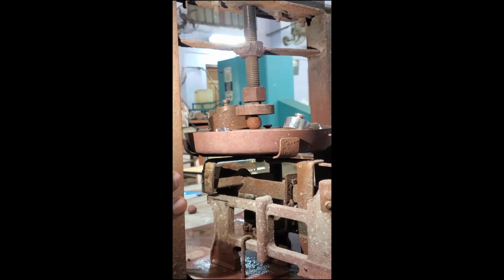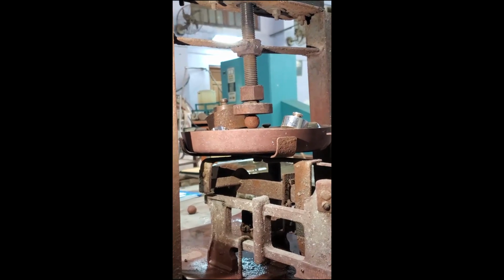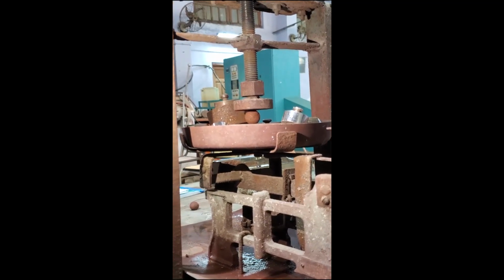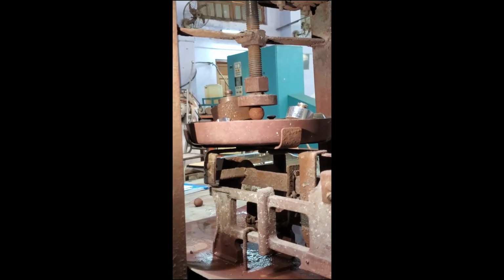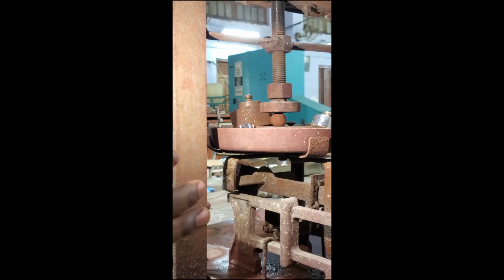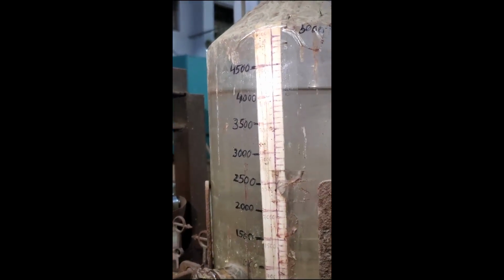As soon as we observe the crack, we have to stop the water filling and see the final reading. Yes. So the pellet is broken and we'll see the final reading.